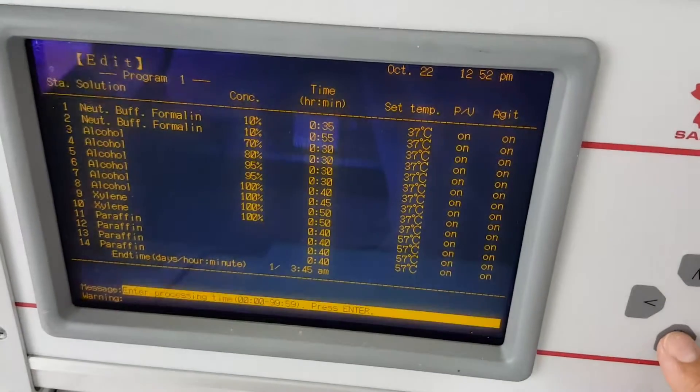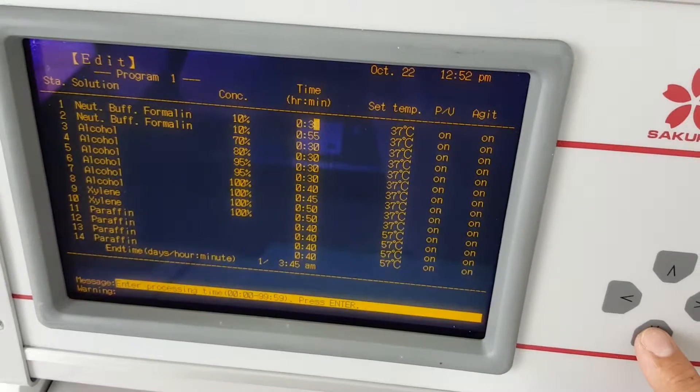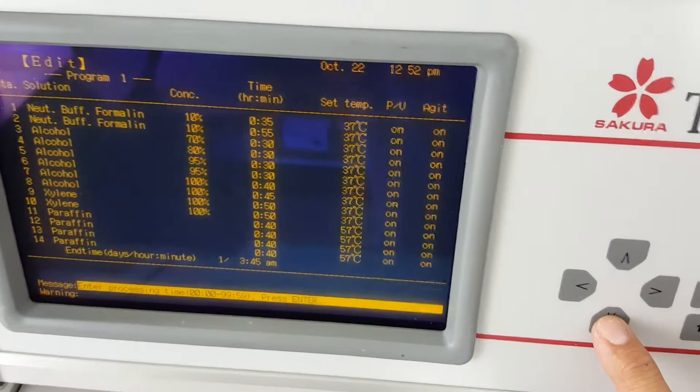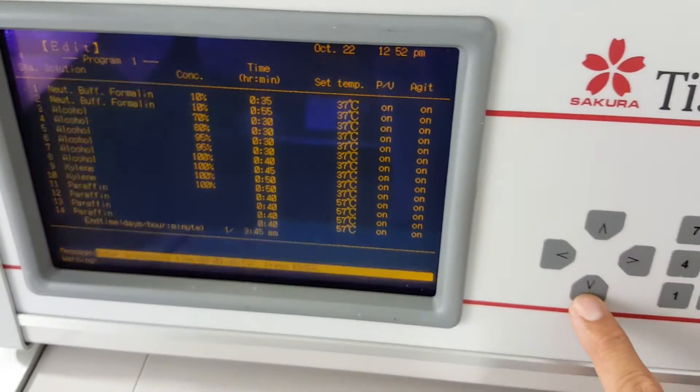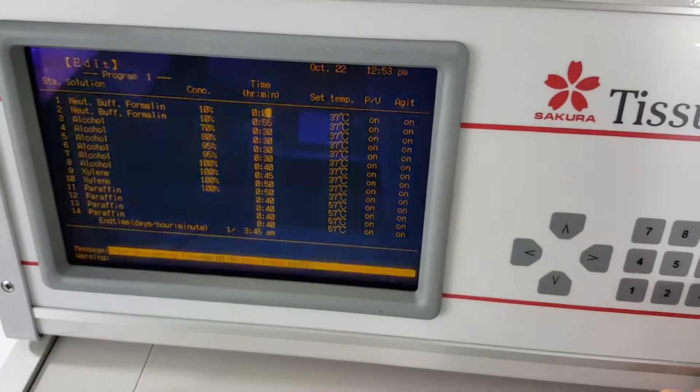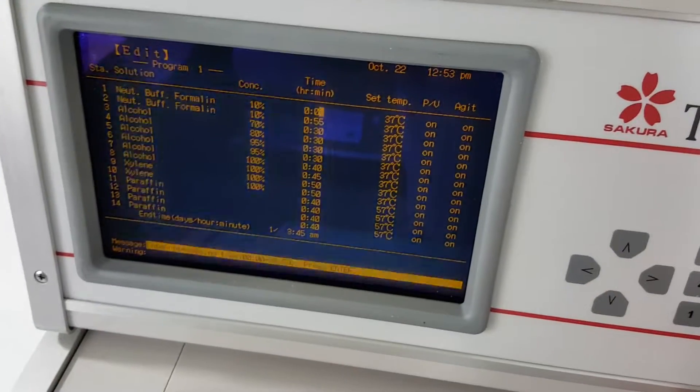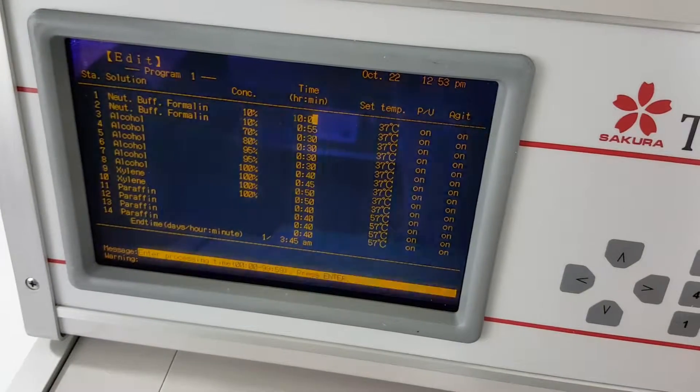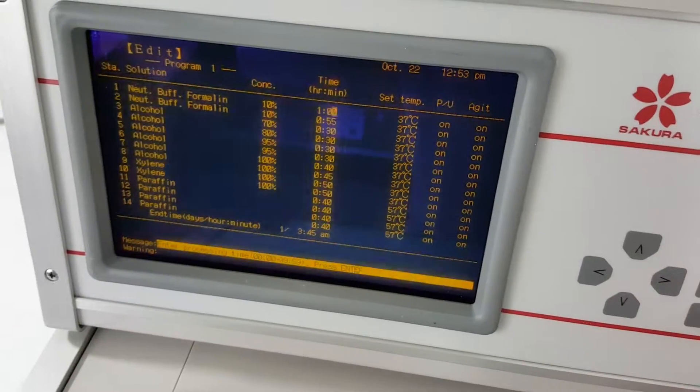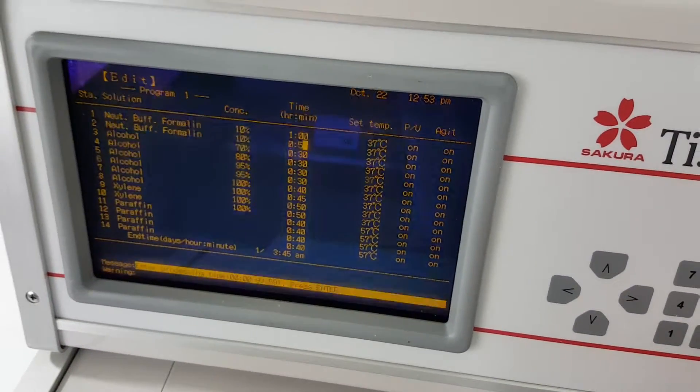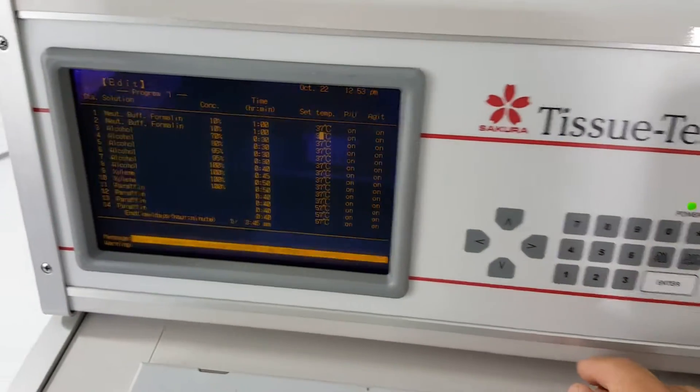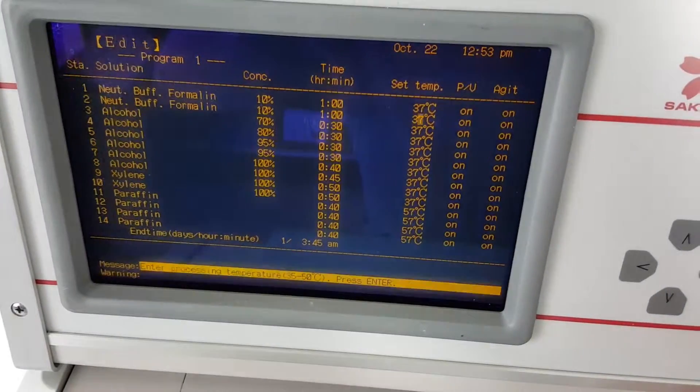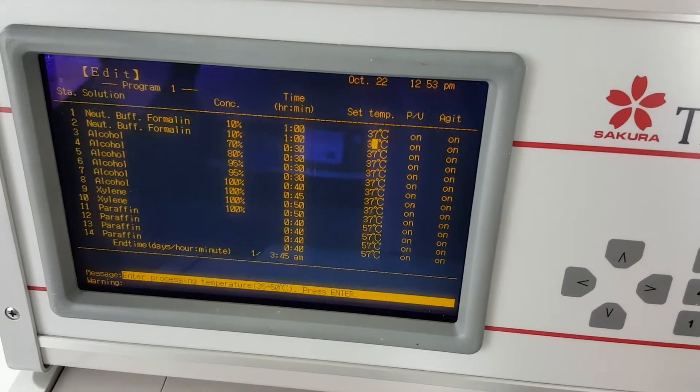So you can't change the concentration here. You'd have to go back to the reagent screen and change that there. You can do the time, the set temp, the pressure vacuum cycle and agitation. We can set this, let's just say to clear this and set it to one. Set temp, that's good, yes. And so on and so forth. I'm just going back and I'm pressing enter and it brings me all the way down to the end. And that is just a brief overview of how you program it. It's the same as the E150 as well.